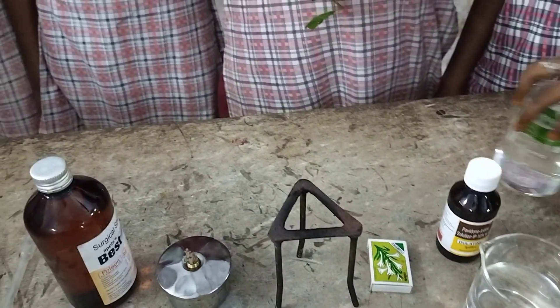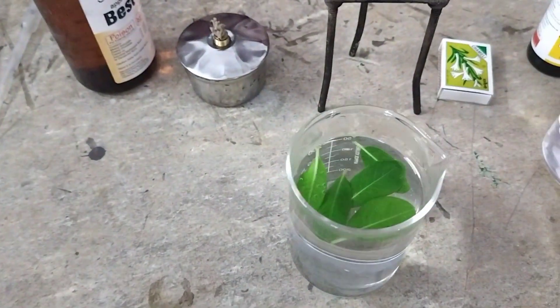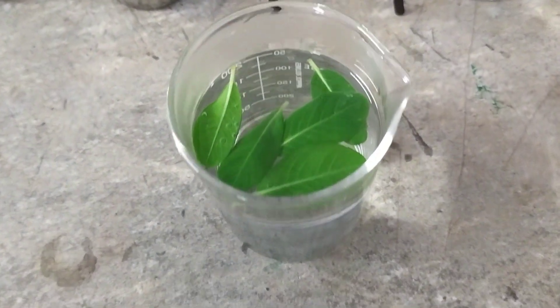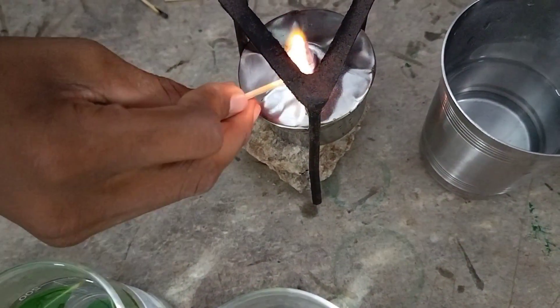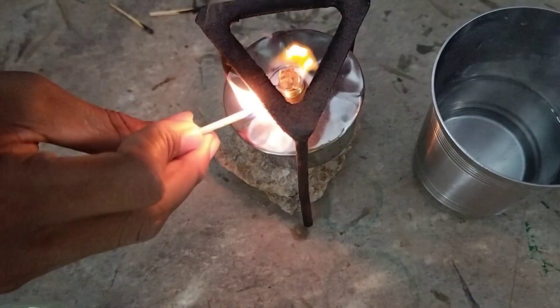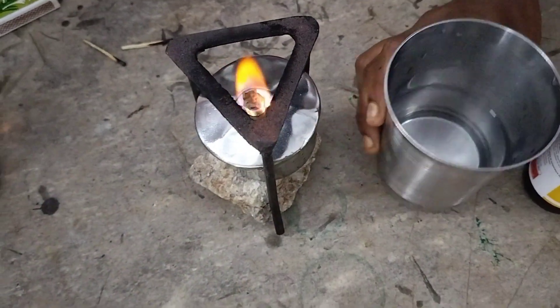First, we have to keep the periwinkle leaves in hot water for a while. After that, we have to turn on the spirit lamp and boil the water which is present in the glass.